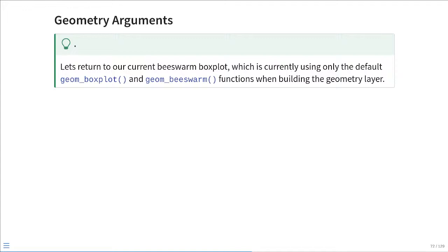So at this point, we have done a lot of customization when it comes to looking at different functions that will build out our geometry layers. But if we step back and think about what's actually happening in these layers, we're building it out from an abstraction, meaning all the major changes are happening right now at that particular level. So if we're going back in and checking to see what's happening at the bigger scale, those are going to be more the cosmetic end.